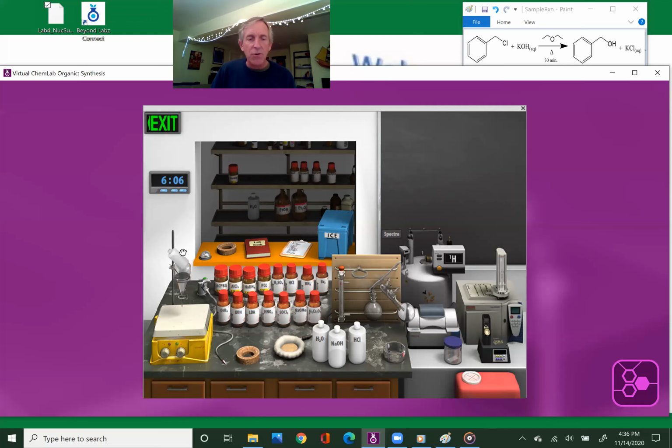And so notice when I go over here, if I want to make sure I get it in there, I have to make sure my hand's over the top of that sep funnel and then let go with the clicker, and boom, 2 layers. If you see real closely, 2 layers have now formed. There is an aqueous layer and now an organic layer that holds just my organic products.